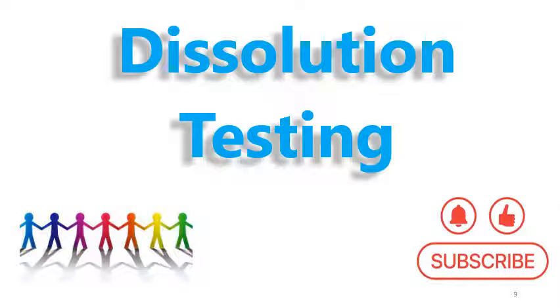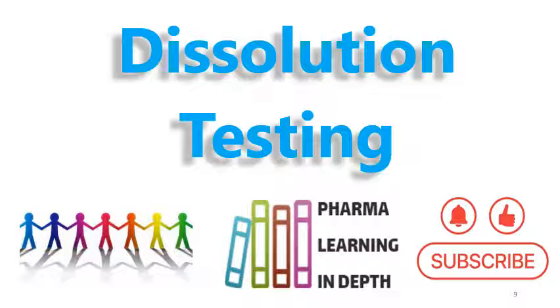So this is regarding the sink factor in dissolution testing. I have made some videos on sink conditions and non-sink conditions, so also watch those videos to have a good understanding.